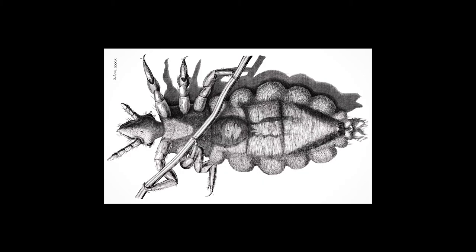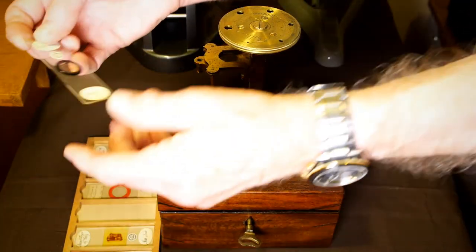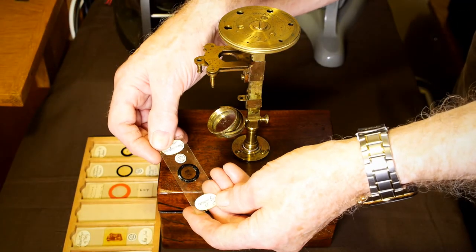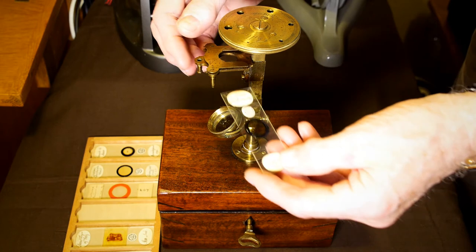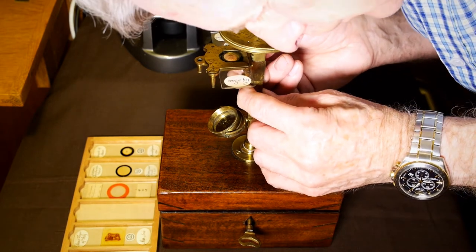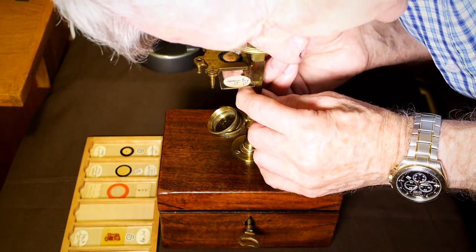I couldn't find a human louse to compare with Robert Hooke's micrograph of one, so we'll take a look at this specimen slide of a pig louse having similar features. Starting with the x5 lens number one, we can see the overall shape.